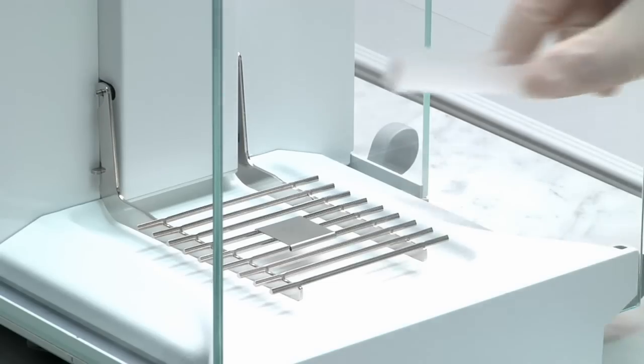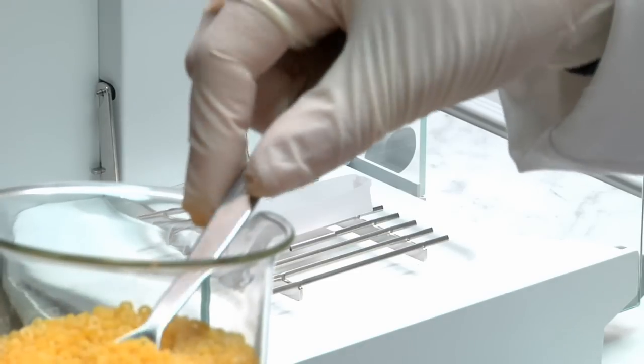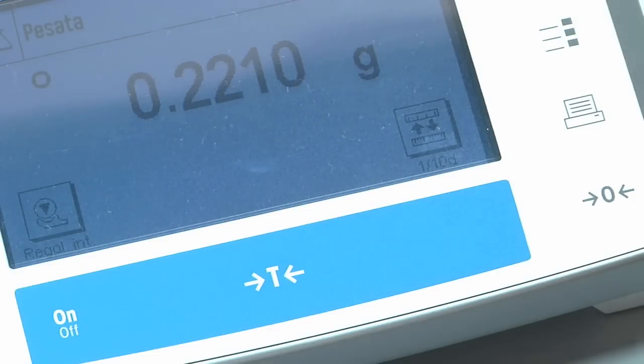Kjeldahl analysis is ideal for solid, semi-solid and liquid samples. Homogenize the sample totally, weigh and transfer it into a Velp glass test tube along with catalyst tablets and reagents according to the official method.